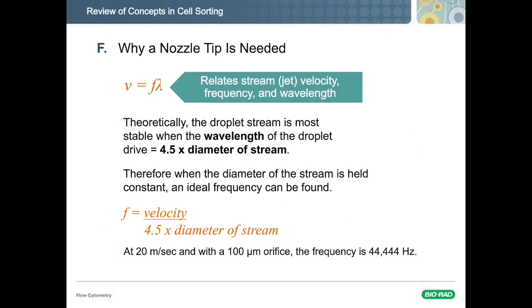And all of that comes back from some of these initial equations to what we're looking at. And the orifice that we have on the S3 is 100 microns. What we end up with driving that at 30 psi, which is chosen mostly because it's a very good point when you have a lot of the cells you want to run for typical use. 100 micron orifice, 30 psi is gentle enough for the cells that you get good viability.